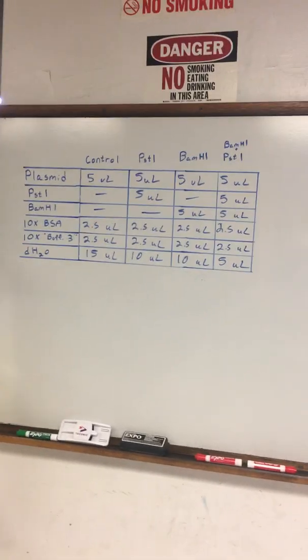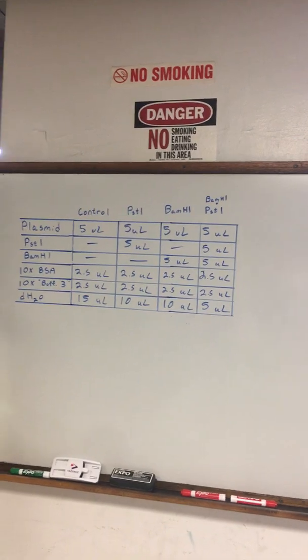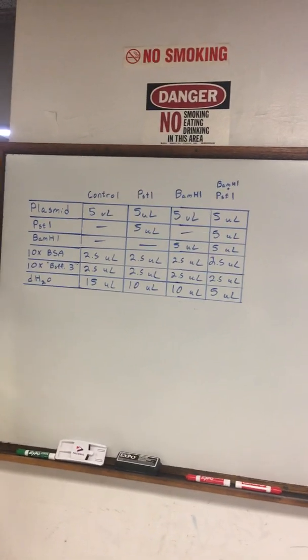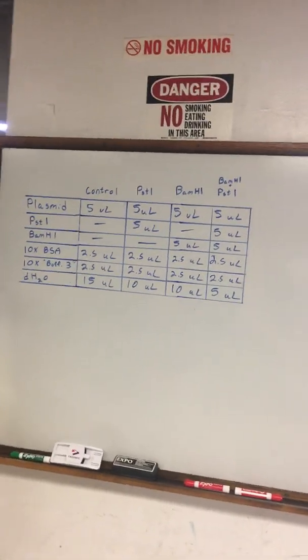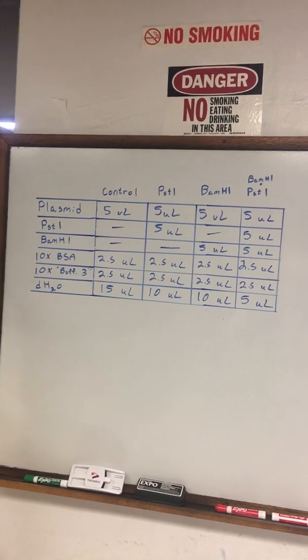Hi everybody, this is Professor Kleiman and Alex Rack, and today we start our labs related to DNA recombinant techniques. The first one we will use is digestion of DNA with restriction enzymes.